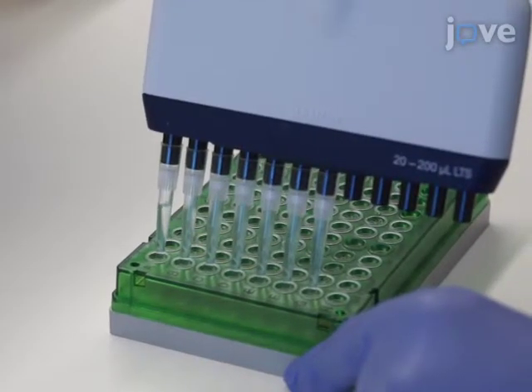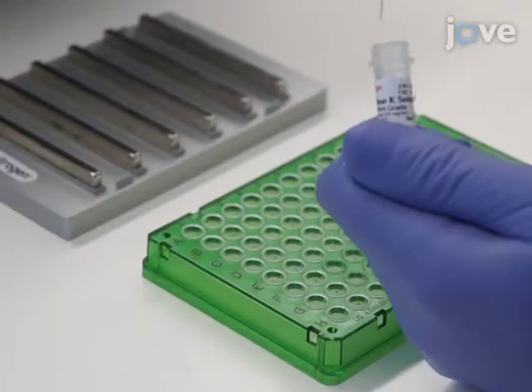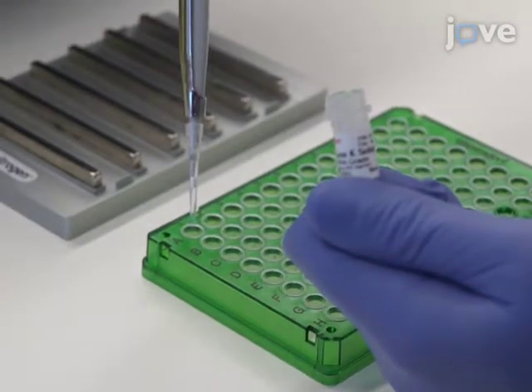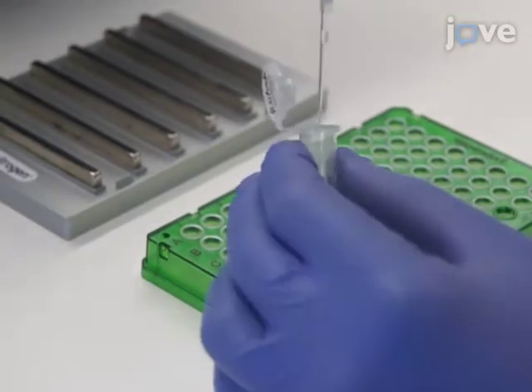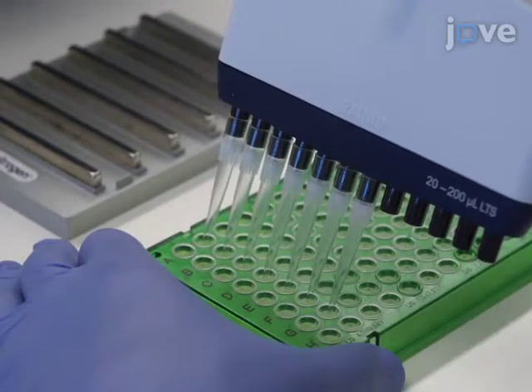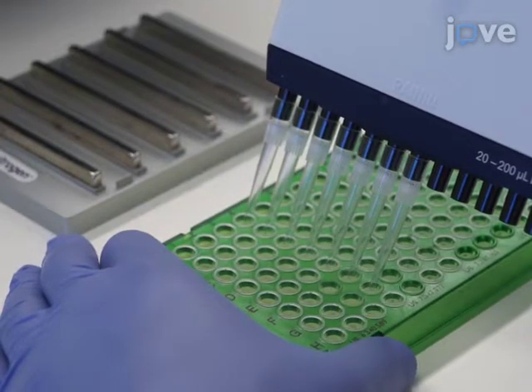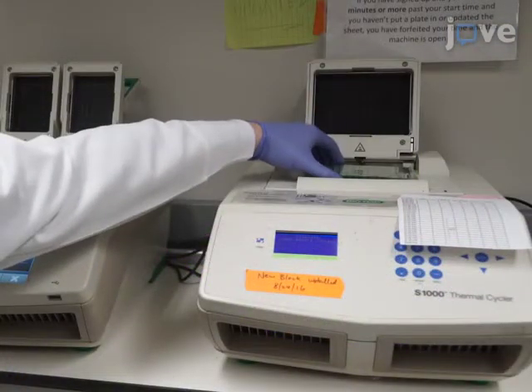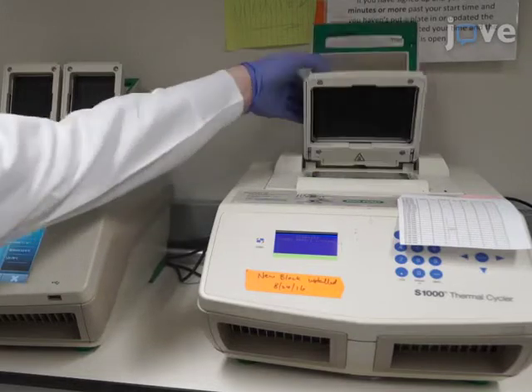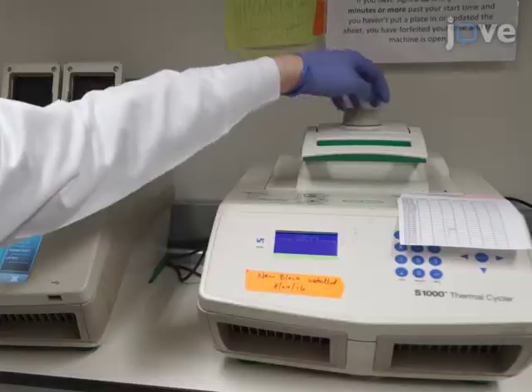After the washing steps, add an elution buffer master mix containing 44 microliters of direct elution buffer, 1 microliter of RNase, and 5 microliters of proteinase K per ChIP, and input the sample for reverse cross-linking. Incubate the samples using a PCR thermal cycler for 4 hours at 37 degrees Celsius, 4 hours at 50 degrees Celsius, and 8 to 16 hours at 65 degrees Celsius.